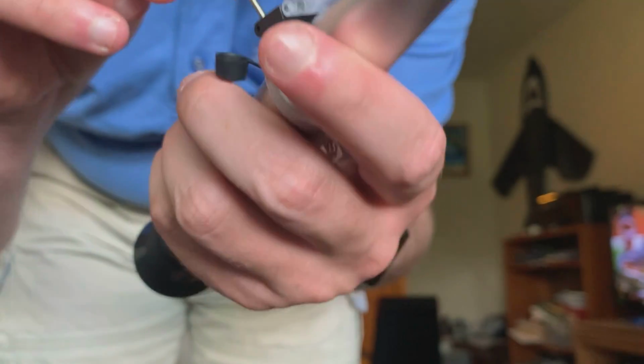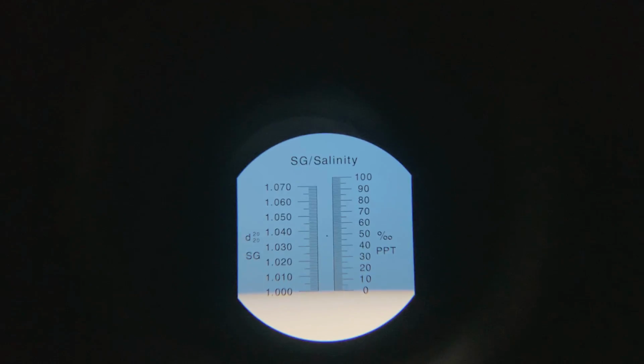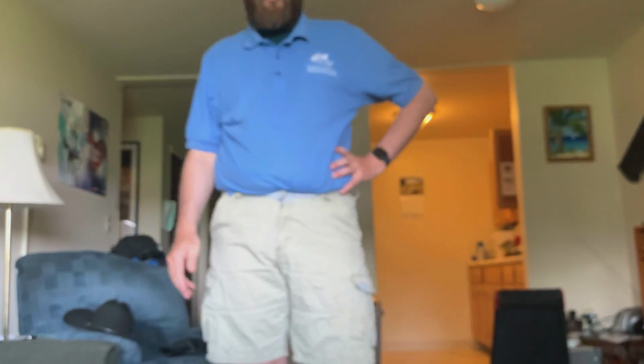And take your calibration tool. Turn it. And now, that's pretty darn good. Almost perfect. That is effectively zero salinity. So, that is now at 000 salinity.